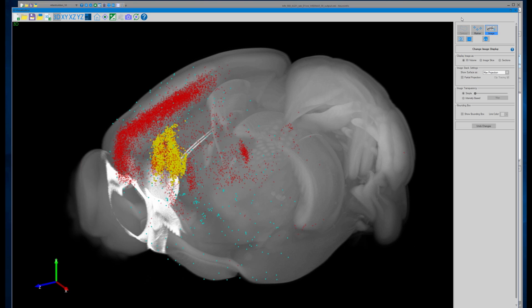Gotcha. I think that's a really practical point. I'm glad you talked to that. Yeah, we have two imaging microscopes that we run, and so we typically can process from brain to finish 4 to 5 brains a week. Oh, cool. Great. And that's basically one person's work. Gotcha. And it's not full time, but it's most of the time.